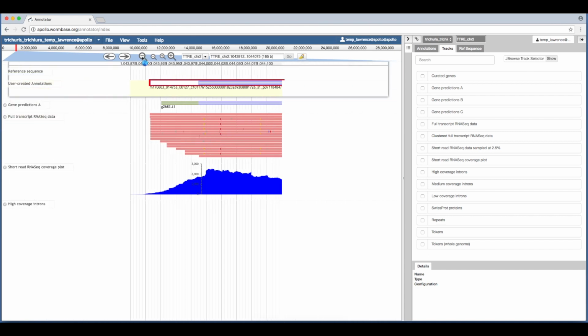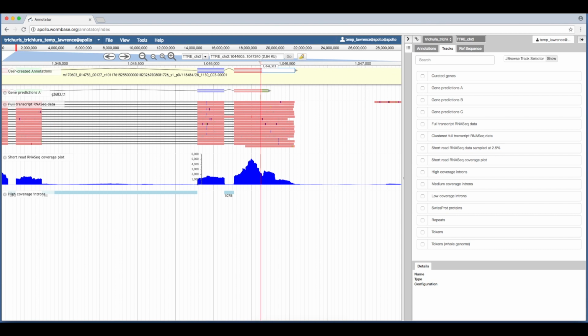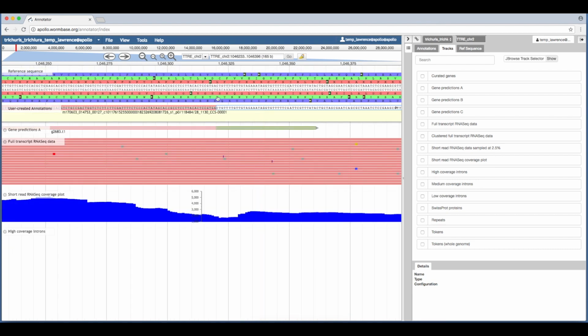So now I'll move on over to the end of the gene and check that it as well has a stop codon. Since this gene is traveling left to right, indicated by this arrow here, we're reading on the top 3 tracks. Since the bar of the exon is red, we're reading the red track. It's important to note that the entire codon is 3 bases long, so although the asterisk is here, it actually ends here.